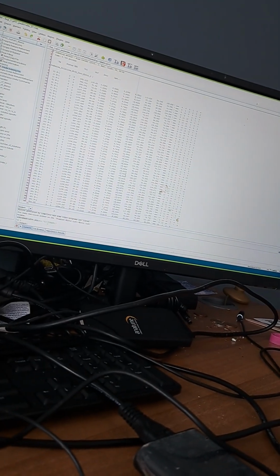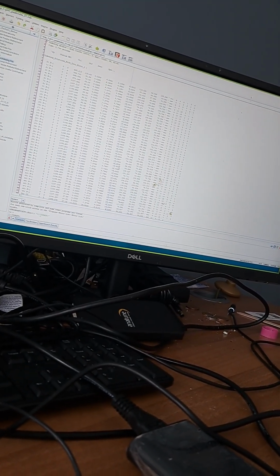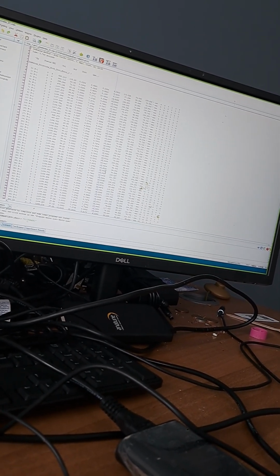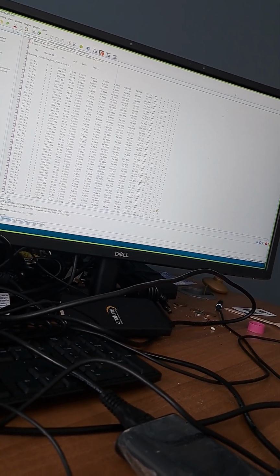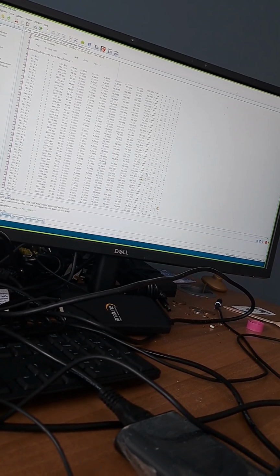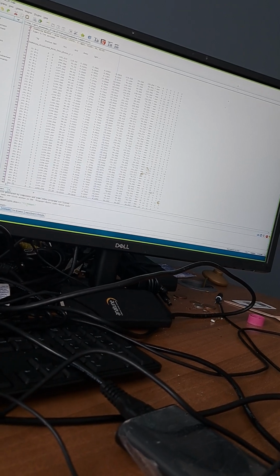I need to do the calculation. But yesterday when I was doing the tutorials within DASH, it says for each chlorine it was 25 angstrom. Like for carbon, there was a table that shows each.